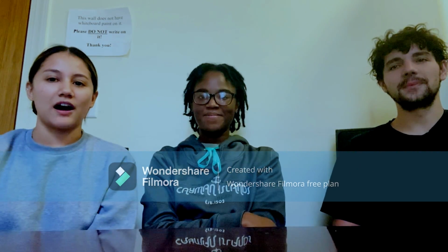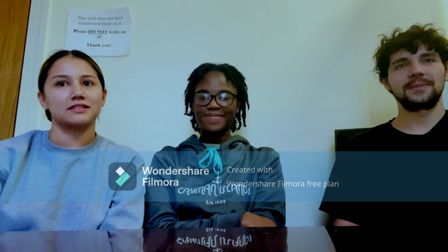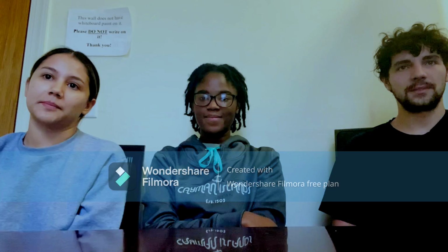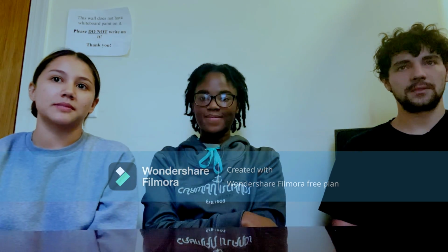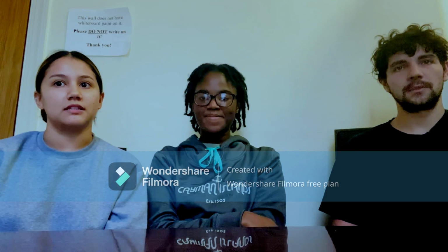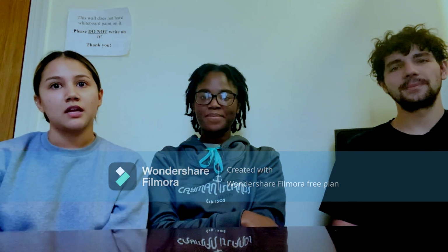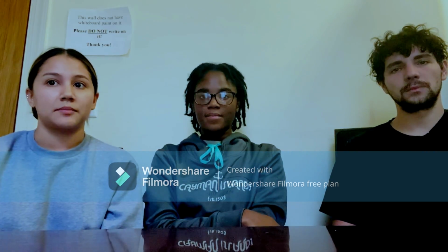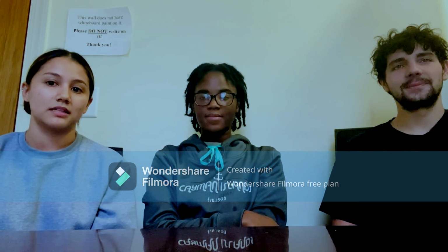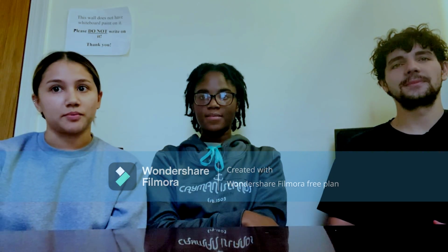I'm Ricardo. We will be demonstrating the Kirby-Bauer technique for antibiotic diffusion. This assay is used to test if a bacterium is resistant or sensitive to a substance. The main purpose of this assay is ultimately to see how much of an agent is needed to inhibit bacterial growth. For the purpose of this video, we will only be demonstrating how to use this assay to test if E. coli is inhibited by cinnamon, boric acid, or toothpaste.